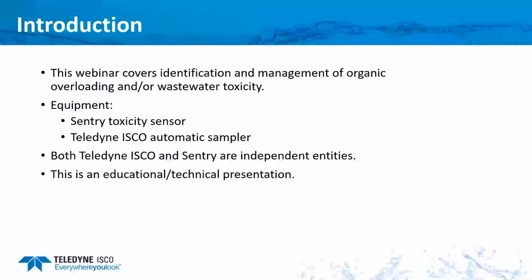But I also would like to mention that this will be a two-part webinar series. Today, in part one, we will discuss event-based sampling. Event is basically a toxicity event sensed by the SENTRY sensor, and then how the Teledyne ISCO sampler can be used to capture that event or capture the samples during that event.